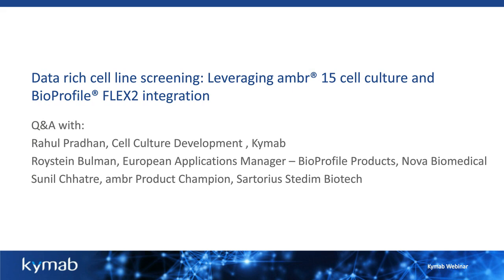I think we have time to squeeze in one more question before our time runs out. That's just come in a second ago. If you are sampling every day from the ambr15, if the process is on day 15, what is the total, approximately 6 ml? What's your initial volume? Yeah, so if you scroll back to some of the webinar charts when you get a chance, we started off at the 15 ml working volume of the ambr system, and depending on the different feeds which went in, we ended up somewhere between 10 to 13 mls at harvest, or even larger for some vessels, depending on what went in.